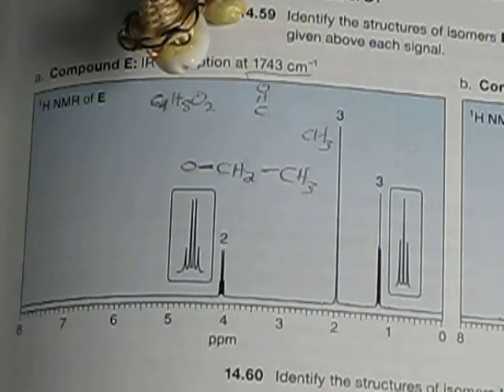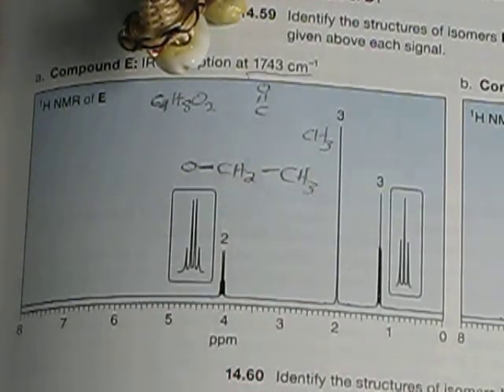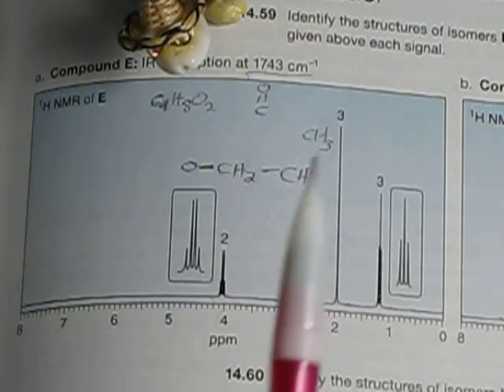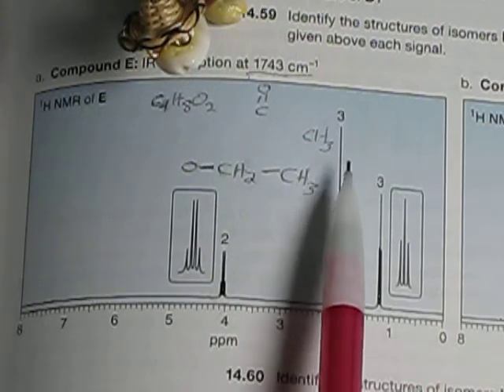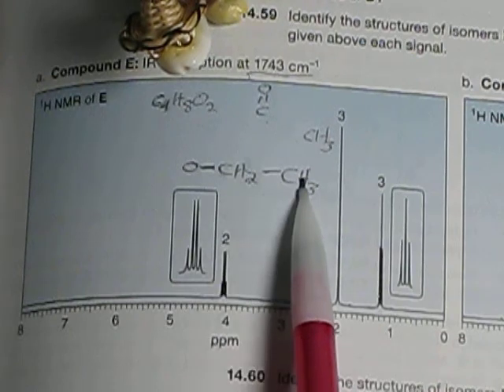So at this point, I am betting that this CH3 is bonded to that carbonyl. Now we're just going to stop here with this one, because let's look at this. We know we have a CH3. We're pretty much guessing, have a good guess we have a CH3 here. We know we have a carbonyl here. We know we have OCH2, CH3.